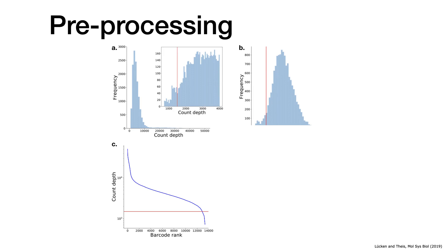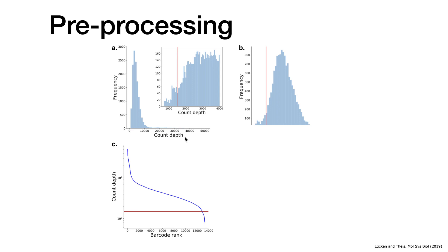Once you've done that, you can look into several parameters. Usually we do these kind of histograms and draw a threshold where we think everything above or below that threshold is a good cell or debris. For example, here I show you the count depth, so the total number of molecules that you detect. We usually talk about counts because we count them, and you can create this kind of histogram.